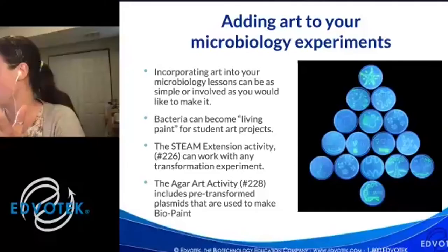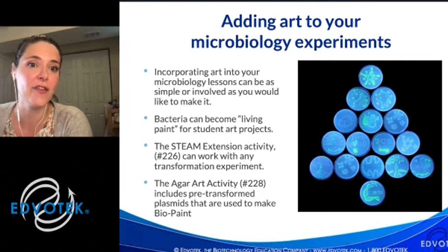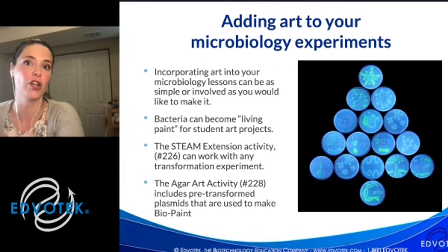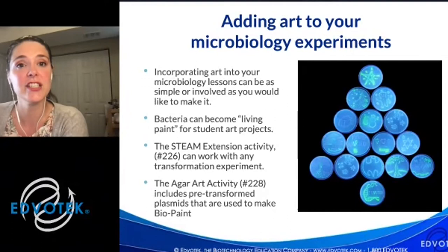So Danielle, how do you get all the different colors in the plates? So basically they are chromogenic proteins, so proteins that can produce color when expressed, and so they're under a T7 promoter. There's no other gene in there, it's just the chromogenic or the fluorescent protein. And we just have it expressed under T7 promoter. So when you have it on a plate with IPTG, it turns on the switch and the colors are there. And so that's why, going back to the original Fleming works and others, they use microbes that have this endogenous color. And it's tricky to get them all to grow at the same rate in the same time.